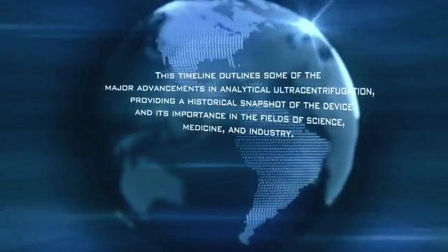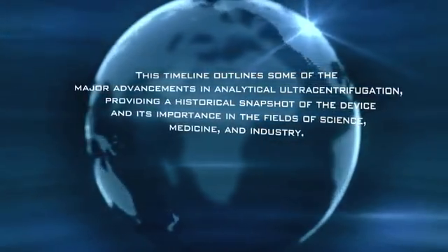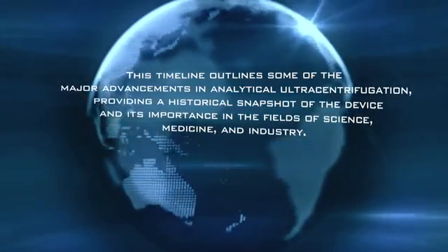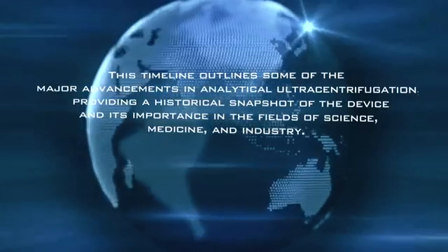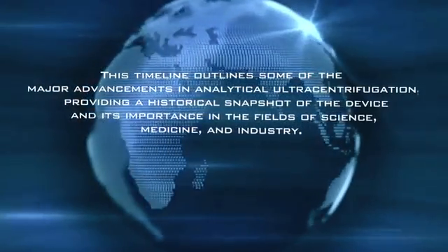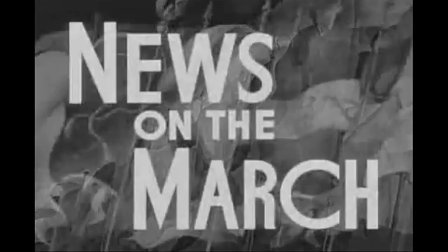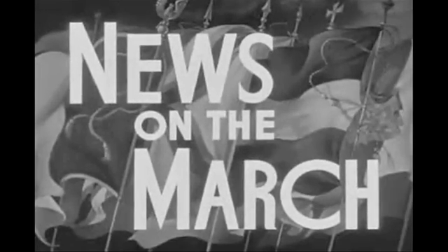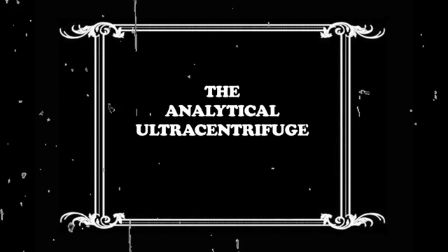This timeline outlines some of the major advancements in analytical ultracentrifugation, providing a historical snapshot of the device and its importance in the fields of science, medicine, and industry. News on the March. The history of the AUC, that's Analytical Ultracentrifuge. The 1920s.